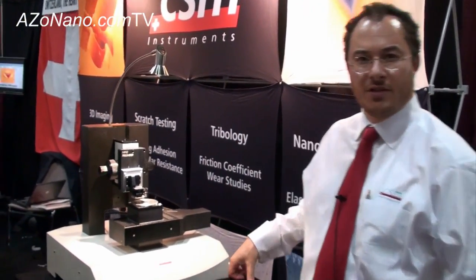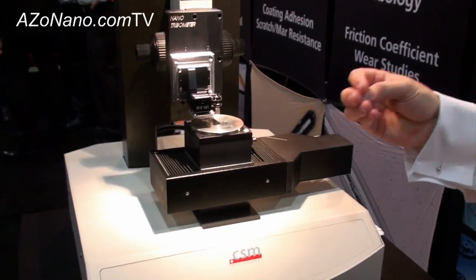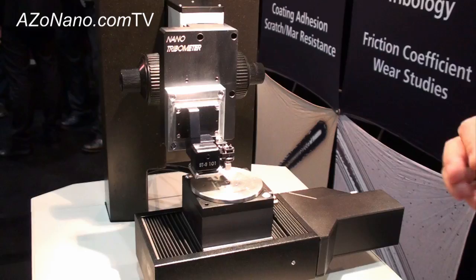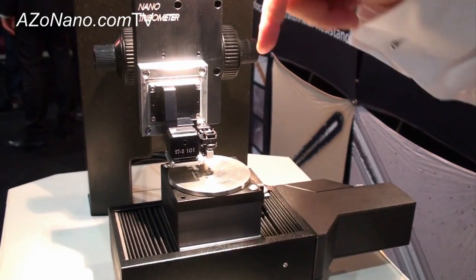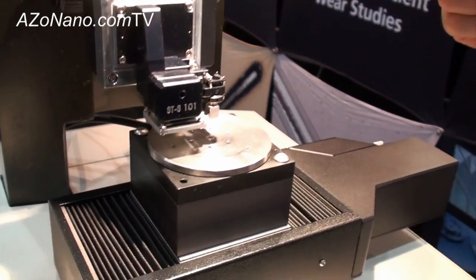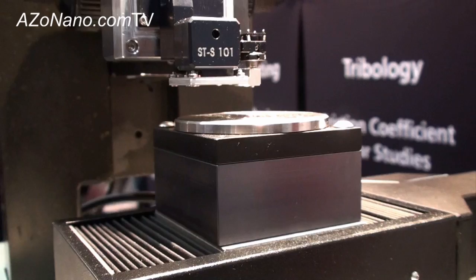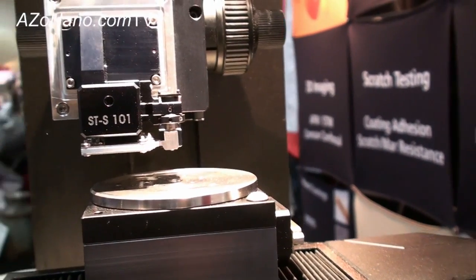This is a small desktop system. It's actually a redevelopment of our existing nanotribometer that's been around for several years. What's particular about this machine is that it now has much better applied load and tangential force sensors, and it's on our small tabletop platform which means it's very compact for a tribometer of this type.